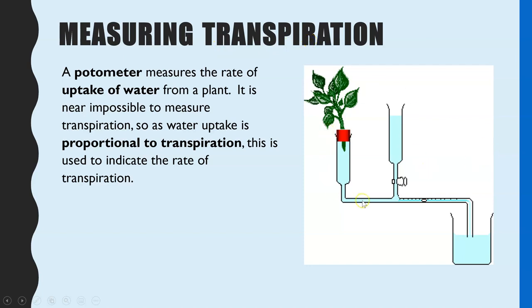It's using this piece of equipment which is called a potometer, and what potometers measure is how much water a particular piece of plant is taking up in a period of time.